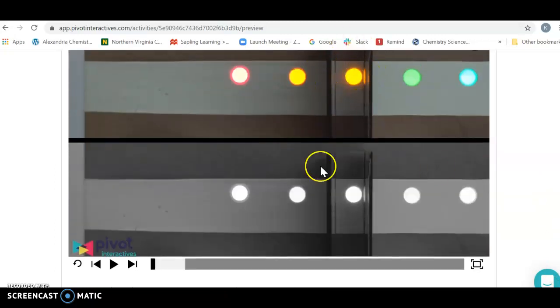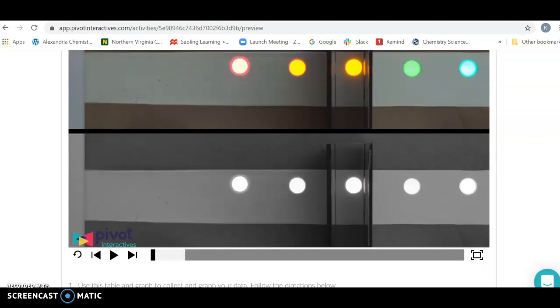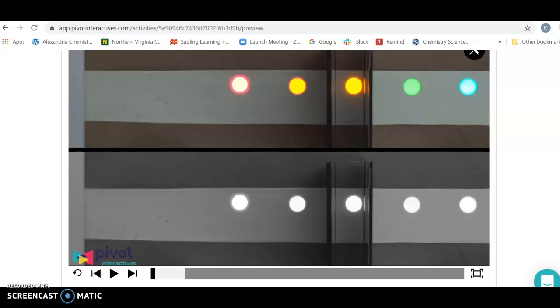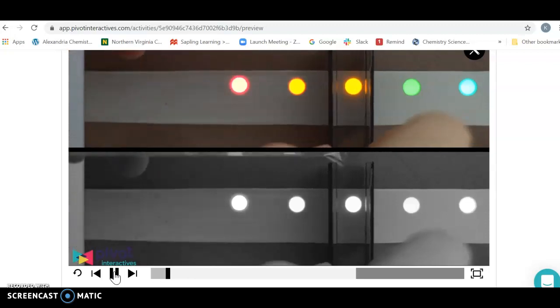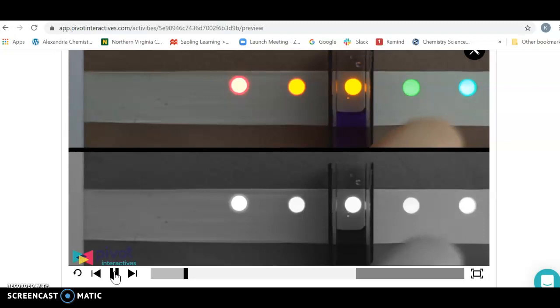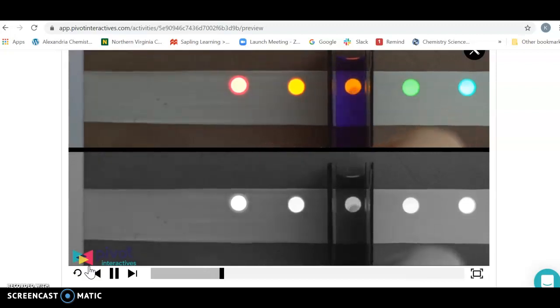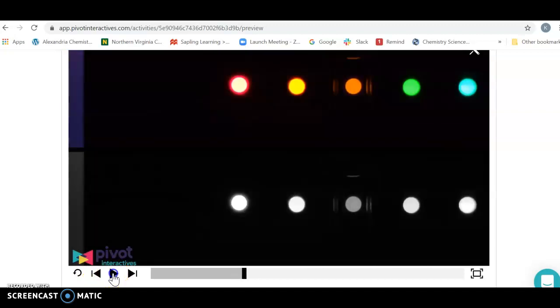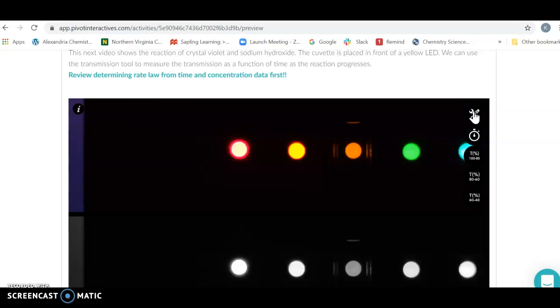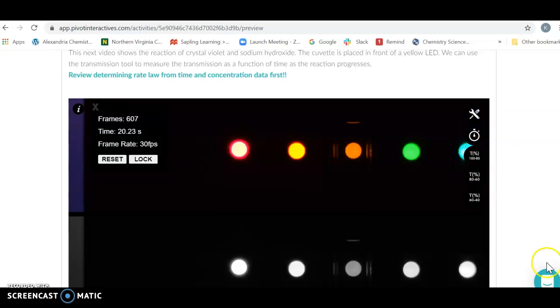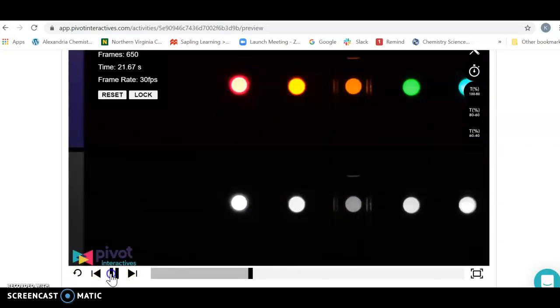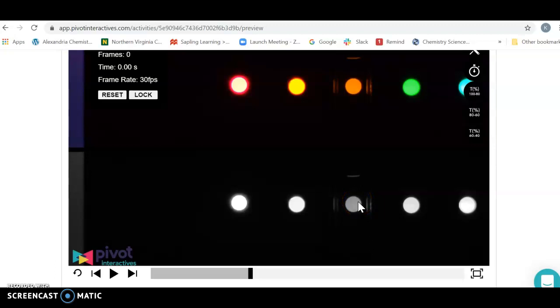For our experiment, they're going to hold the cuvette directly above the yellow. If I press play, they're going to pour in the crystal violet and then the sodium hydroxide. Don't worry about getting the data right now because it's going to take a second to mix. The color is going to shift a little, and you know you can get started when they turn the light off so you can actually look at the grayscale. Once you have the grayscale up, pull out your tools, your stopwatch, and your ruler. I'm going to reset my time and call that time zero — it doesn't matter where I start, it's all relative.